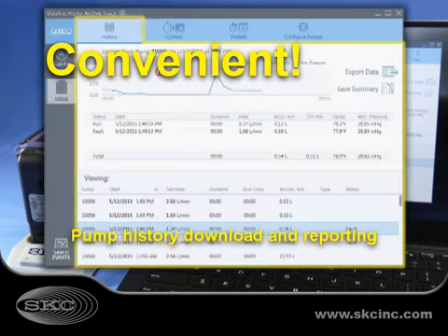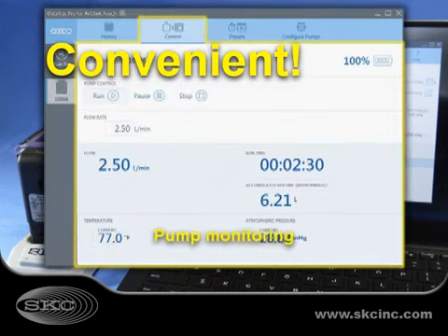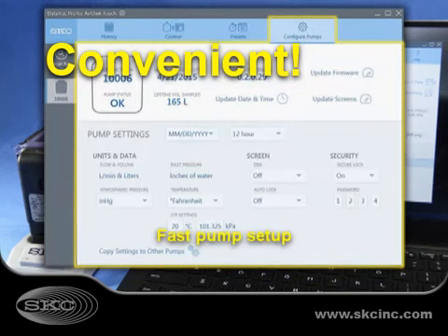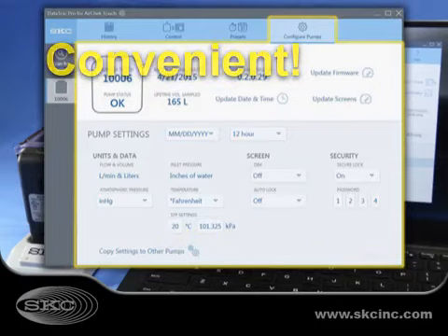Download sampling history for reporting, monitor pump operation, program sampling presets, and adjust pump settings all from your PC.